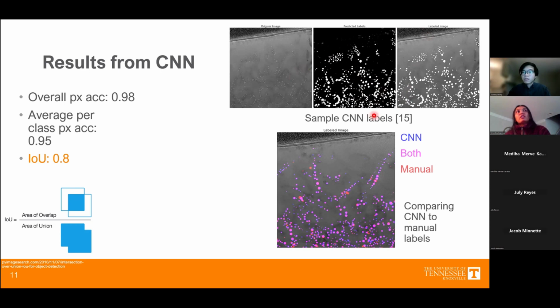Yeah, distance loss function, it's a kind of loss function based on, for an object, if you define the center, and from the center you are defining the boundary. That kind of loss function really optimizes the boundaries of your objects. So I would share a paper with you after this.